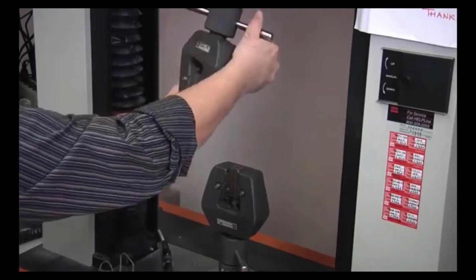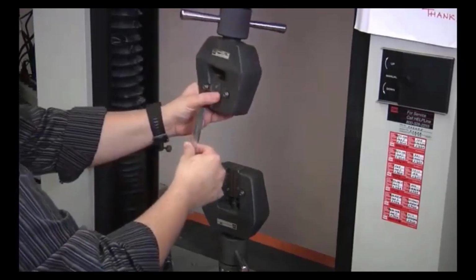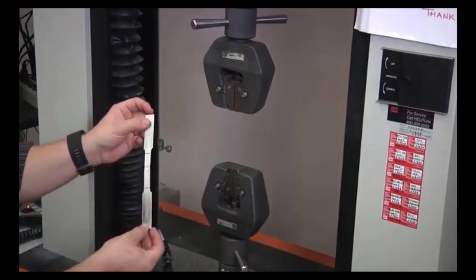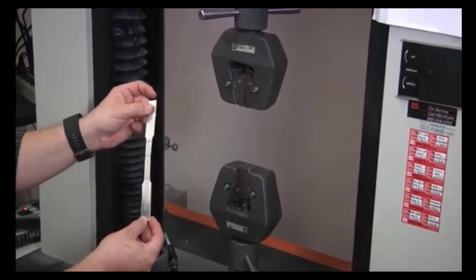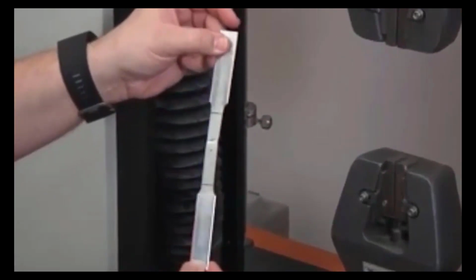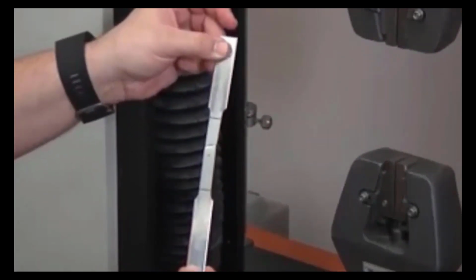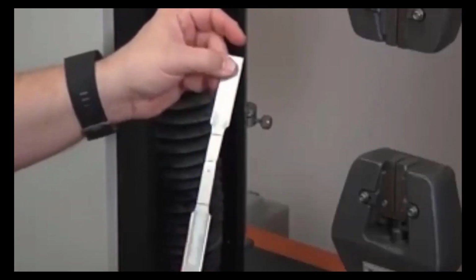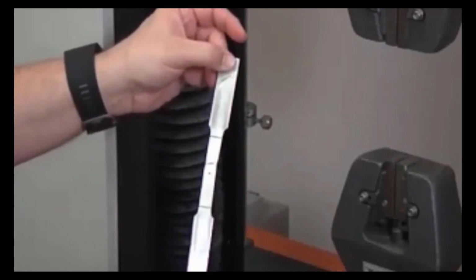So if I'm careful, I can remove the specimen, and it is still more or less in one piece. If I look at it carefully, I can actually see through the fracture, and again, there's just 2 small bits of metal at the very edge still holding it together, but it would not take much to finish breaking that.